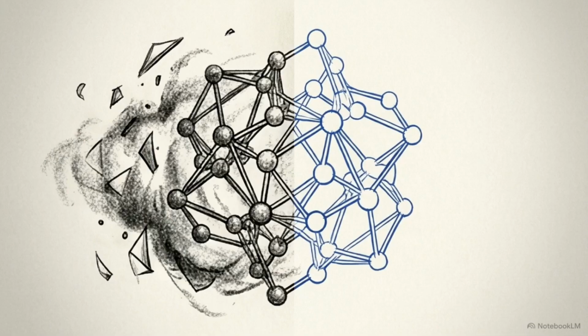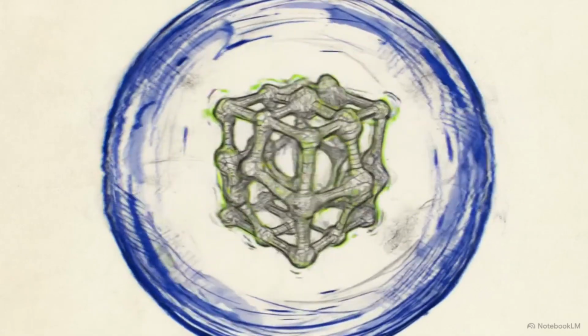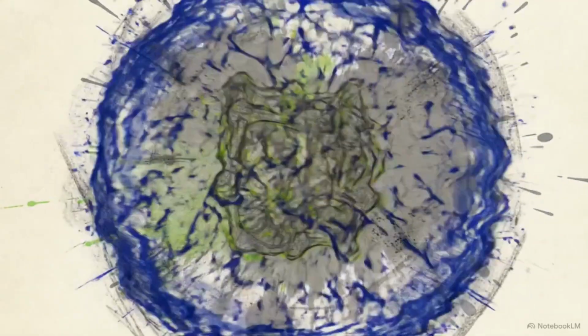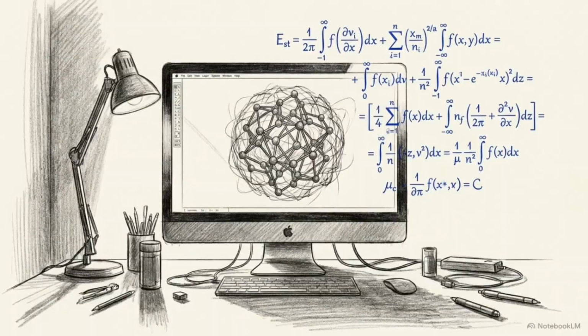But before the human can rebuild anything, the map itself must be cleaned. Without a statistical intervention to break the phase bias, the structural model will permanently stall in a hallucinated reality, unable to converge on the truth. To construct a clean map, crystallographers replace basic raw structure factors with maximum likelihood target functions.